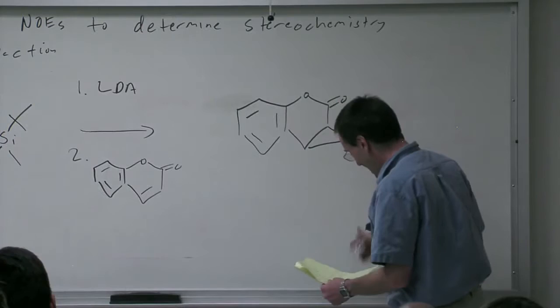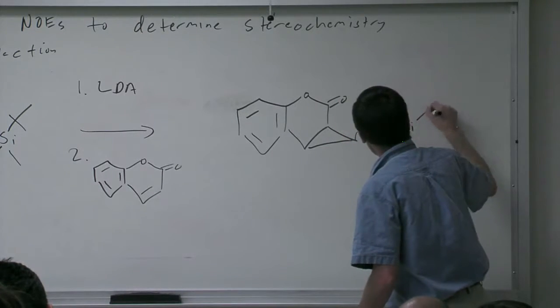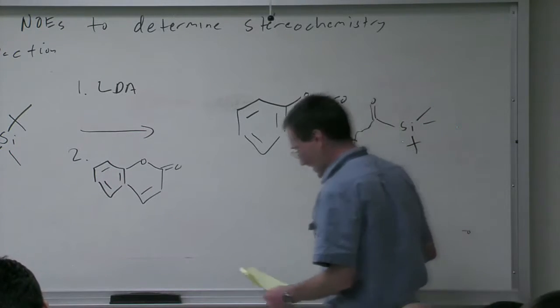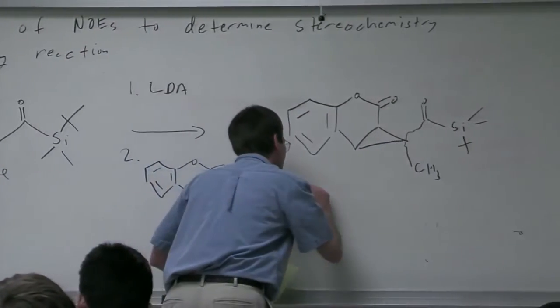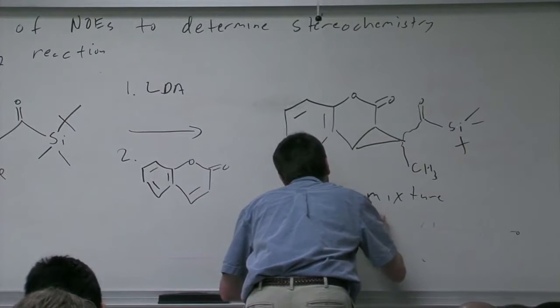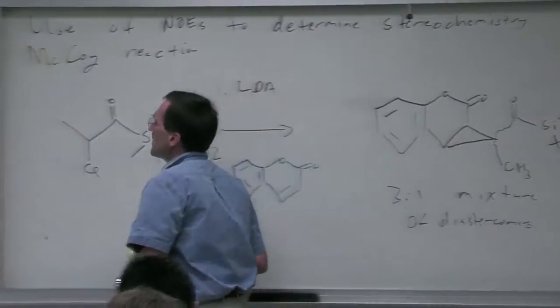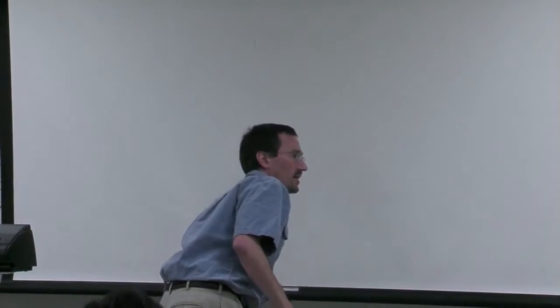So this is the McCoy reaction. All right. So the product that we get is a cyclopropane of undetermined stereochemistry. And fortunately, in this particular example, we have a 3-to-1 mixture of diastereomers. All right, let me pull down the screen and give us a chance to take a look at the spectrum of these two diastereomers.